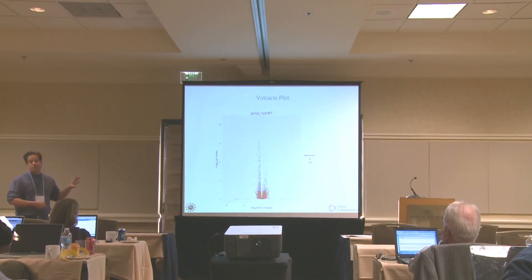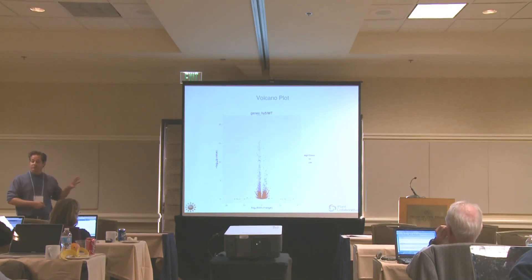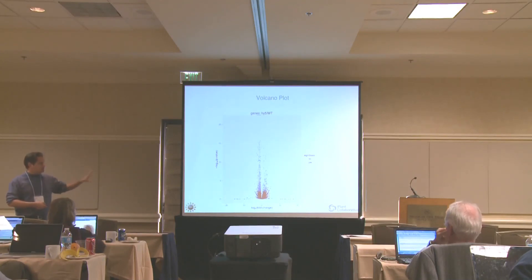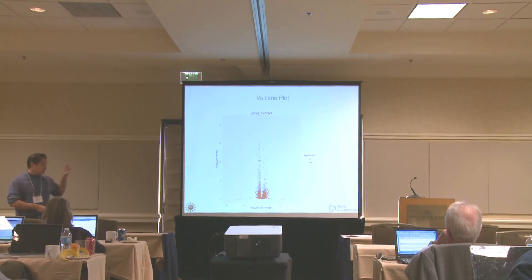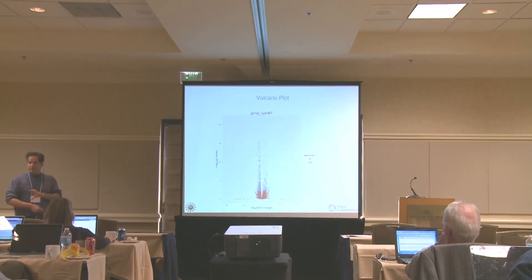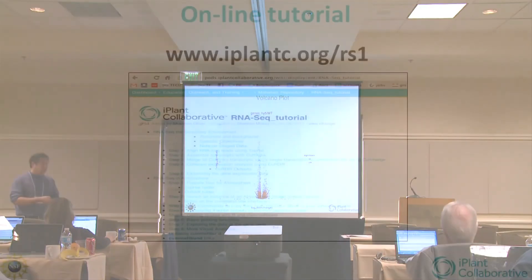If you go through the tutorial, you can drill a lot deeper and start looking at individual gene expression. But this is the outcome of the analysis in the discovery environment, where you end up with data tables, graphs, and the raw outputs of the CuffDiff and other components of the workflow.